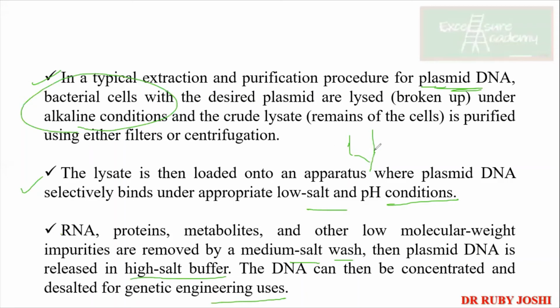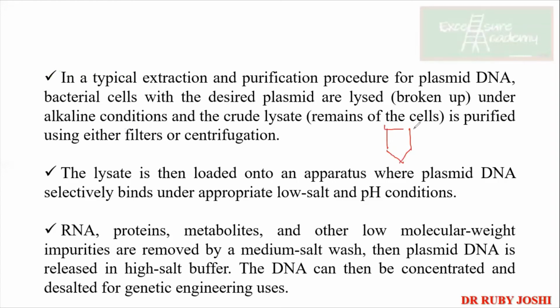Okay? So in the column, see, this is how. Wait, let me draw it properly for you guys. So this is how your column is. Yeah, your cap is done. Here, this is your column actually. Okay, in the Eppendorf, this column sits. So you added the lysate. So this column is designed in such a way that only the plasmid DNA should bind. But sometimes the associated proteins, the associated metabolites will also get stuck. Okay, so that will be removed when you give a wash with the medium salt or low salt conditions. So what will happen? These small impurities will be washed off.